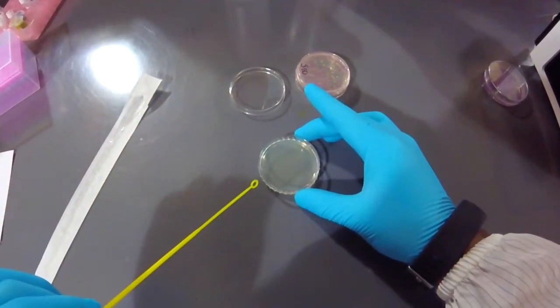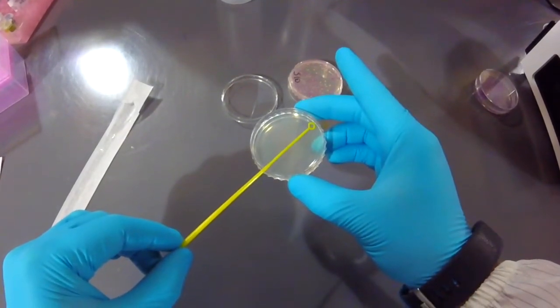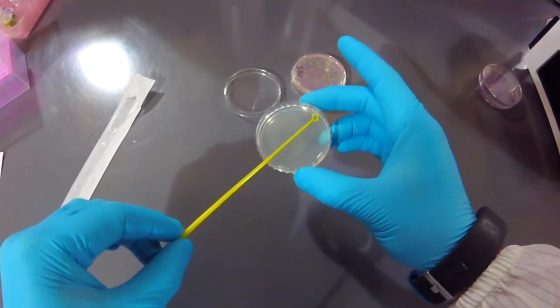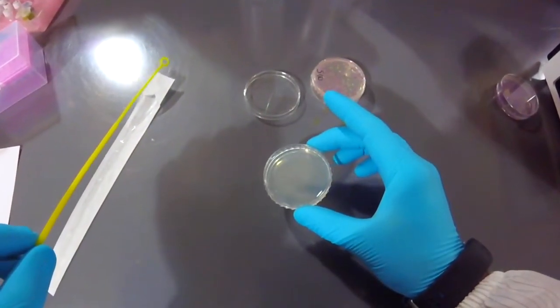And then, now I'm going to use the other side, which hasn't touched anything, and I'm just going to make sure the tip and the other side don't touch. So again, this is clean, and I'm going to very gently zigzag across.